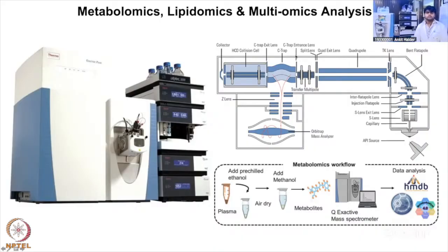So this instrument, what we're going to show you now, which will be another Orbitrap instrument, is a hybrid, where we can do the things for proteomics as well as for the metabolomics, but we primarily use this instrument along with the UHPLC for doing the metabolomics application. And here we have the quadrupole Orbitrap, that's what is hybrid, unlike the Fusion, which is the tribrid instrument, where the ion trap was added.